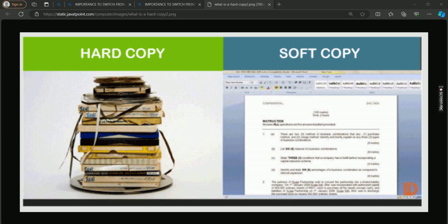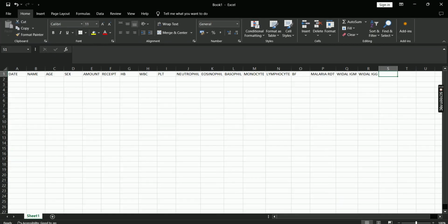Now, some labs have done well and have been capturing data using Excel. This is a great tool because at the end of the day, the analysis that we have studied so far is done using data in Excel.